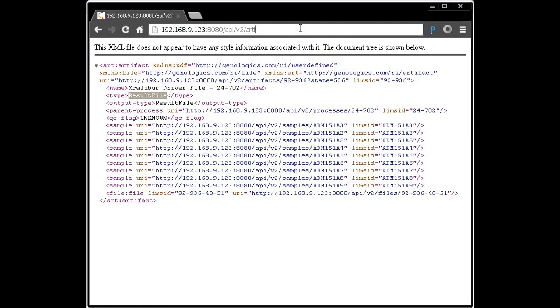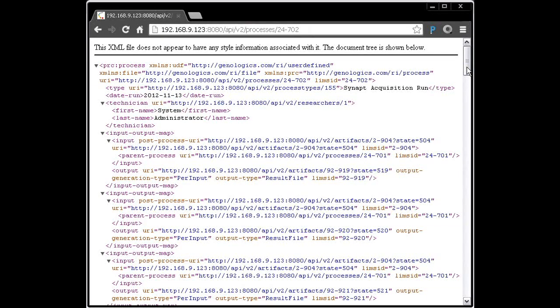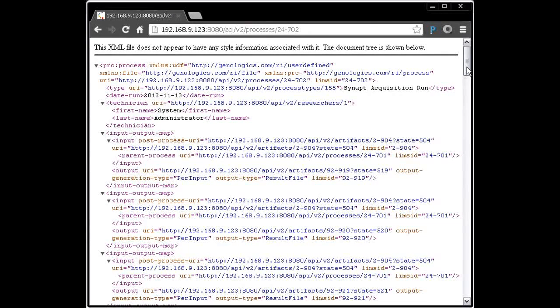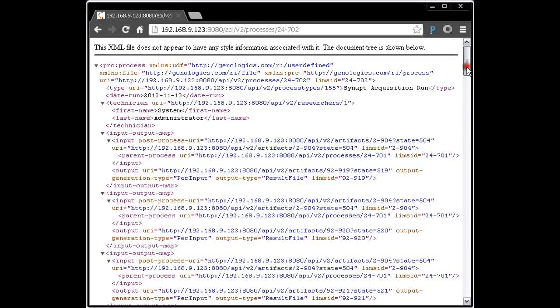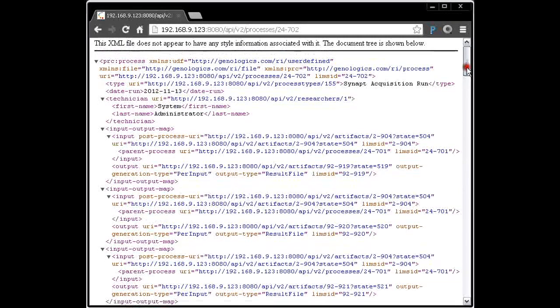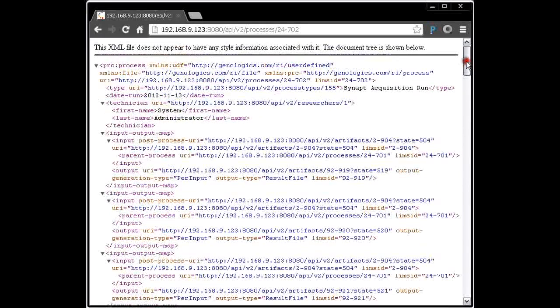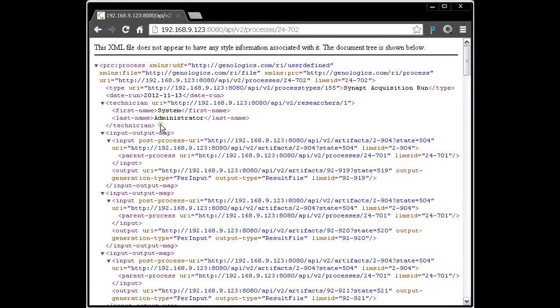This time, we want to be looking not under artifacts but under processes. Put in our LIMS ID. Now we've got quite a lot of XML which represents that process. Processes are the core of tracking things in the LIMS, and they'll be separate videos and sessions related to those. But at this stage, at least, we wanted to look at the XML definition of this process. It has things at the beginning, such as who the technician was, when it was run, etc.